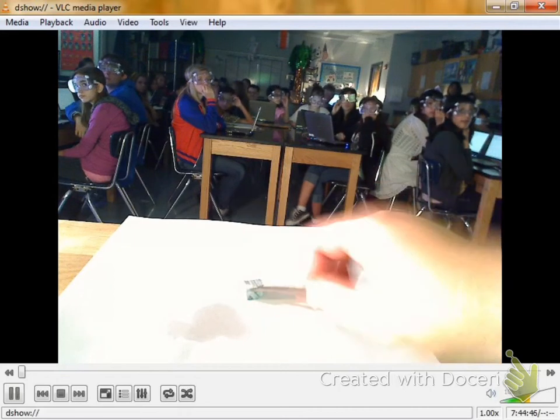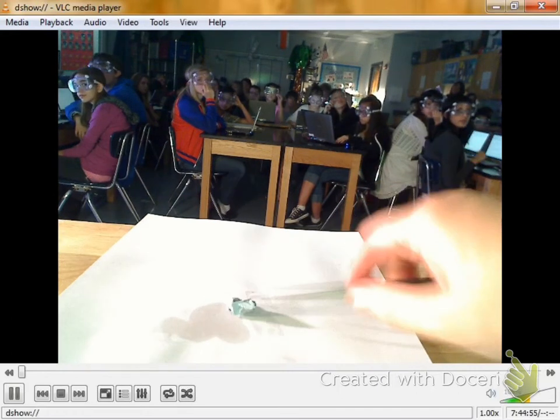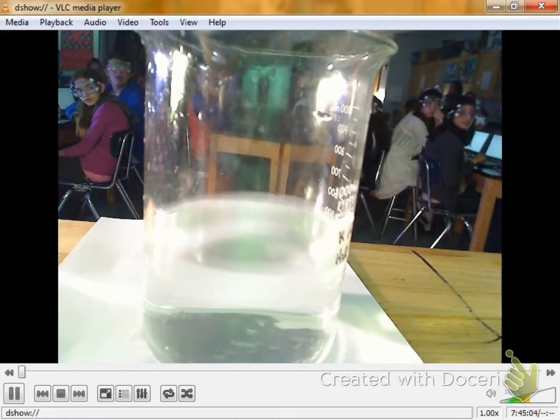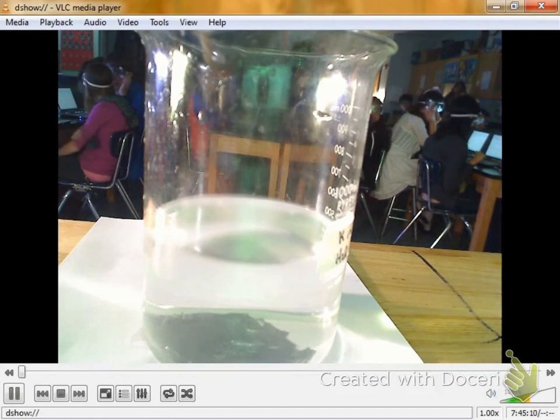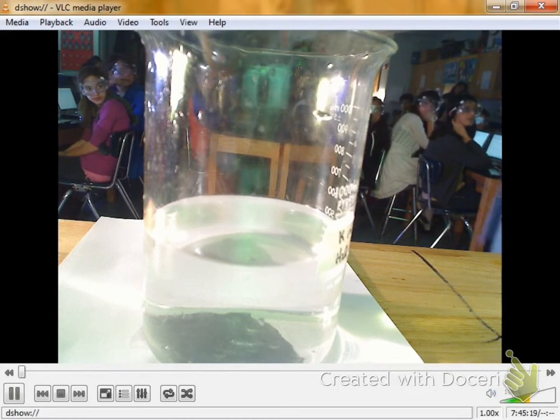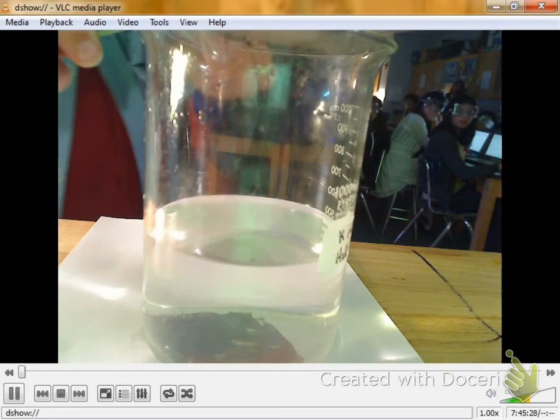Cut like butter. It moves like putty. You see me holding this stuff? Alright. What do you think? More reactive, less reactive? Now, I have to admit, part of this has to do with size. Compare it to the first piece of sodium, because I wanted to make it go boom. I put a big piece of sodium in the second time. So in your minds, compare this to the second piece of sodium.